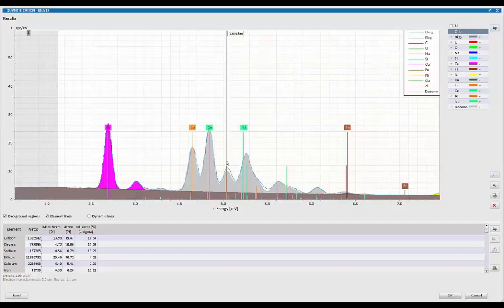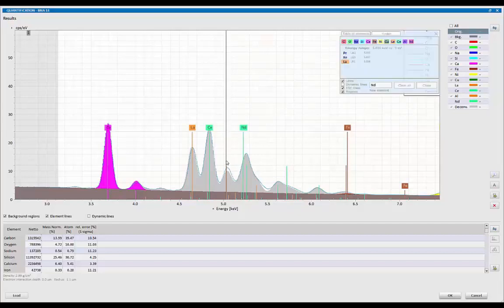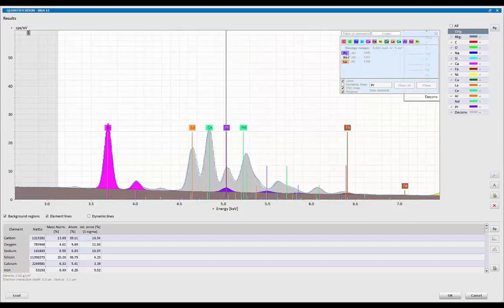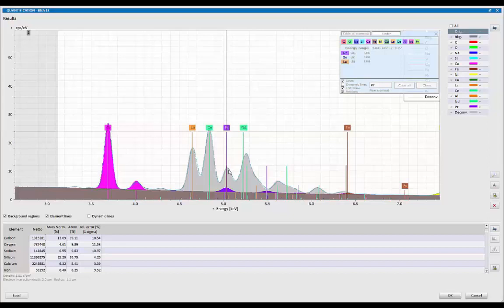And if I double-click on it, the system will come up in finder mode on the periodic table and says, look, praseodymium could be in there. As soon as I clicked on it, it added that to the list and redid the analysis. And notice now the peak is filled and there's my portion of praseodymium.